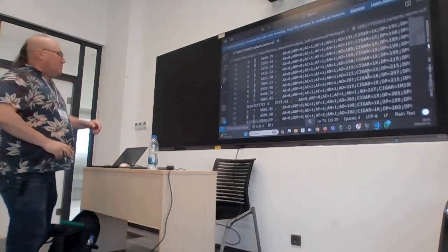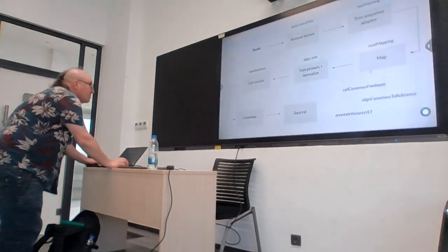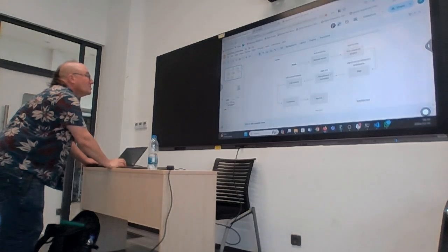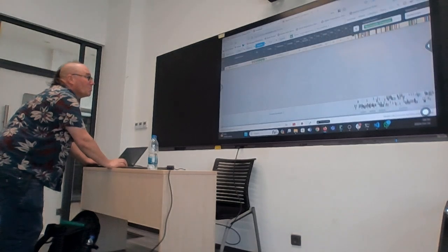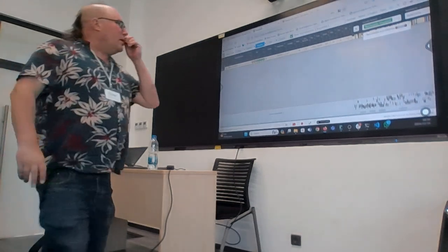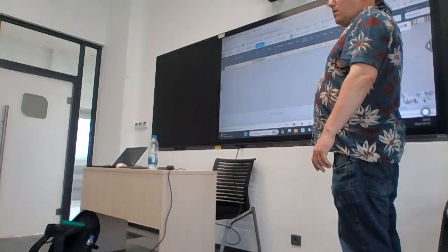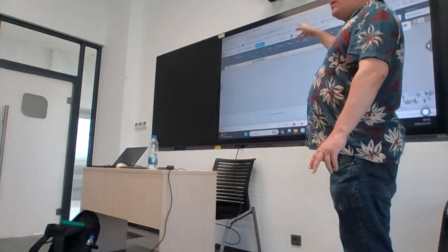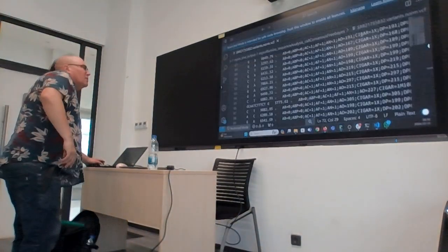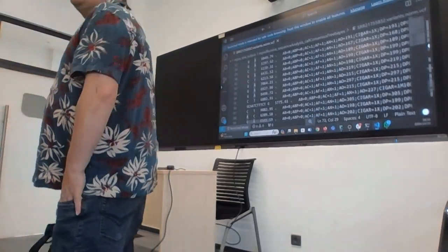But anyway, so let's look at some of this and go back to nextclade. When we look at nextclade, can somebody maybe translate that bit that I said about the variants into frames quickly? What do these things mean on this side? Can somebody help translate?